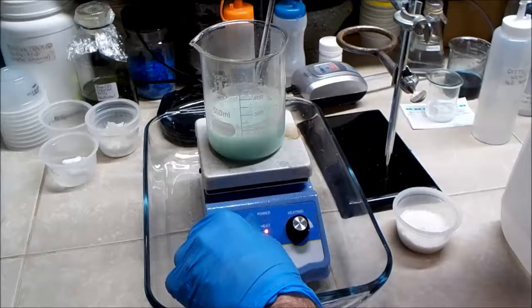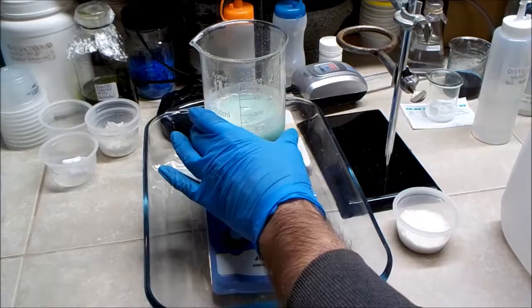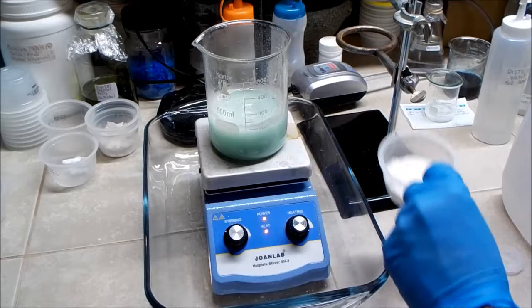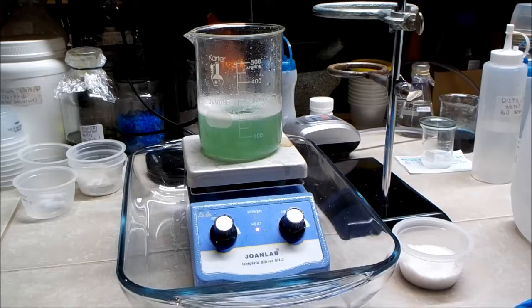I also turn on the heat, that'll help it dissolve. There we go. I'll wait till that dissolves before I add the ammonium sulfate. Okay, so it looks like the iron sulfate has dissolved, so now I'll be adding the ammonium sulfate. I'll turn the stirring back on.